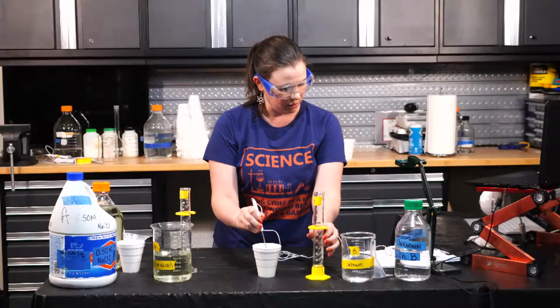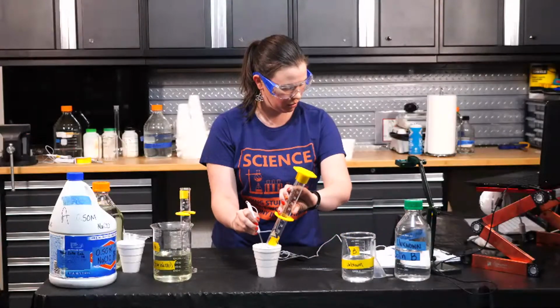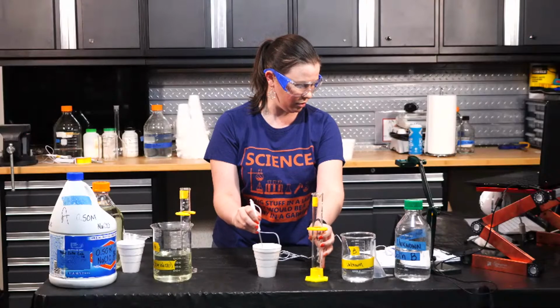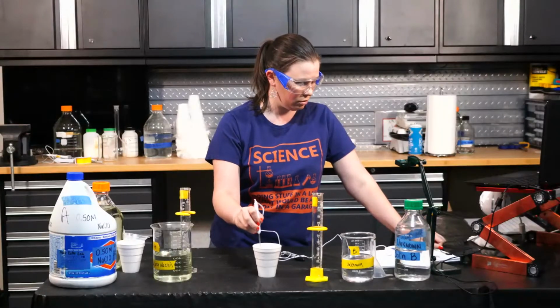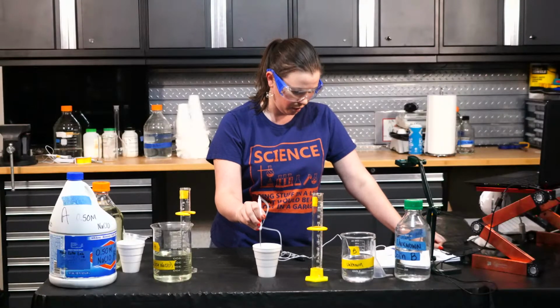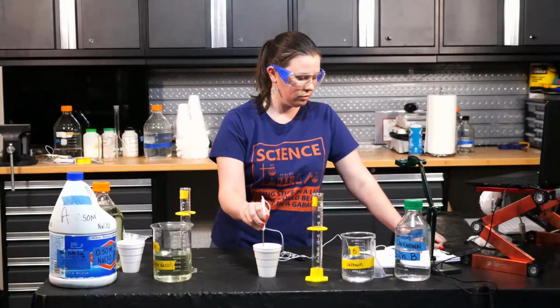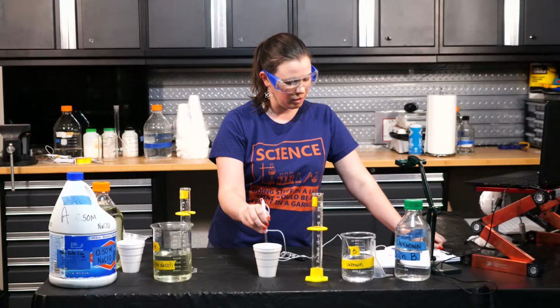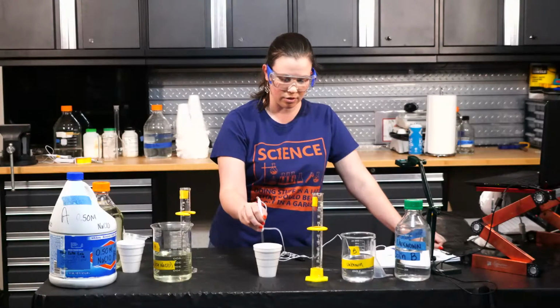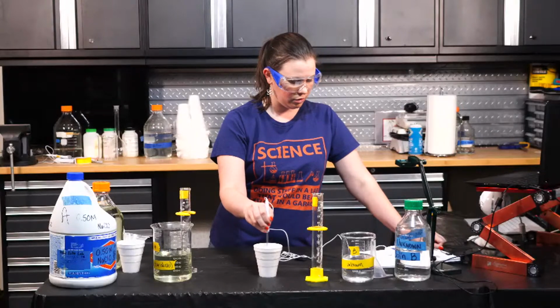So now I'm going to mix in my 15 milliliters of solution B. We get 21.8, jump to 30.6, 32.9, 33.6, 34.5, 34.8, 34.9, 35.0, 35.0, 35.0, and still 35.0. Seeming like we've hit our plateau here. Give it another second, just in case. 35.0 still. So we're going to call it 35.0 degrees Celsius for level 4.